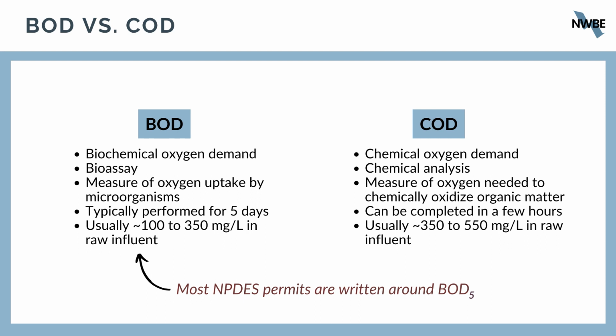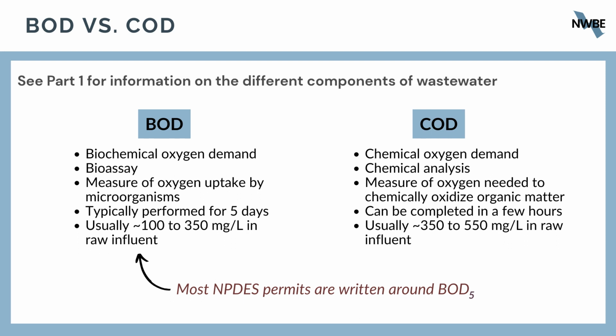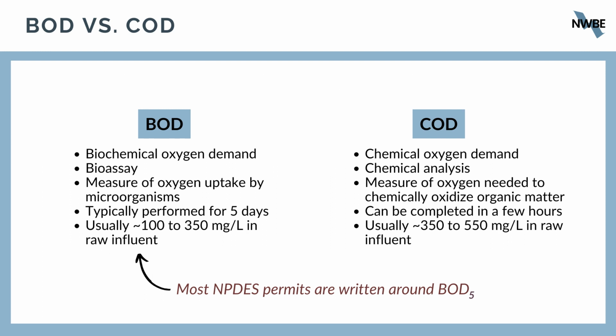And when we think about interpreting wastewater disease surveillance data, one of the things that's often done is to normalize the nucleic acid concentrations to account for really how much domestic sewage is in the wastewater sample. And way back in part 1 of this series, we talked about the different components of wastewater, and that the stuff that we flush down the toilets is only one of those components, and there are many others. So there are different ways to normalize gene copies per liter, but probably the most common is with the use of a fecal indicator using molecular methods to quantify the presence of that fecal indicator. So something like pepper mild mottle virus or crAssphage.